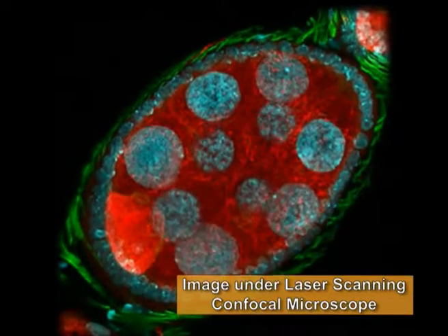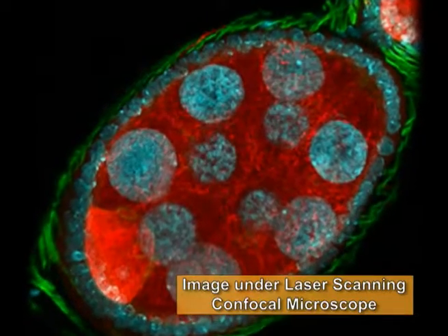The implication of raster scan and collection of information from all layers is that once we have the whole information of the cell, we also have information from all the layers. And this method is known as optical sectioning. That is, without physically sectioning the sample, we have information from all layers of the sample. That Z distance, the difference between these two layers, can also be controlled.